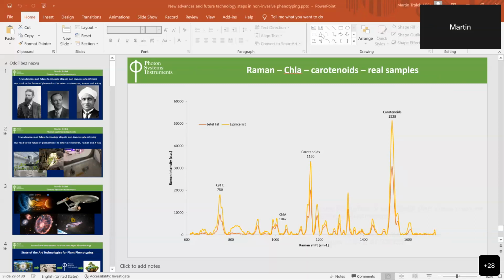So I hope that answers it: inorganic is in principle possible, but it depends on which type of molecules you are talking about, and what the signals are which they provide using this Raman excitation light. You need to be able to detect and get a good signal to compare with what else is in the sample you have.